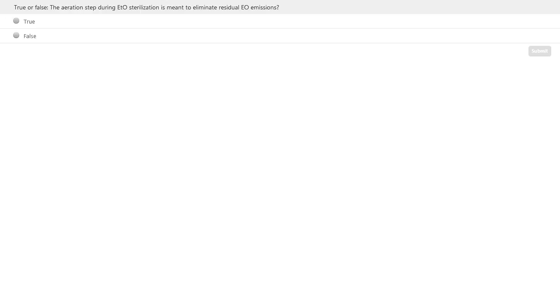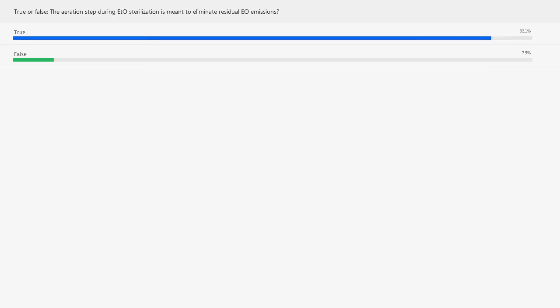All right. The question is, true or false? The aeration step during ETO sterilization is meant to eliminate residual EO emissions. Is that a true or a false statement? And the winner is true. The vast majority of the audience feels that that is a true statement.